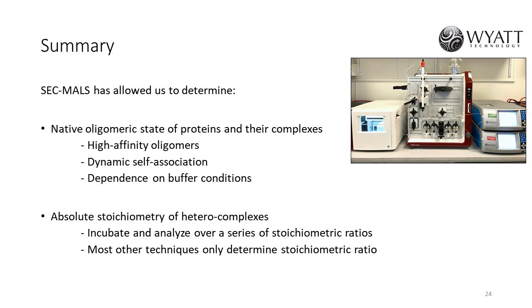Okay, thank you. What is the molecular weight of the largest complexes? Are you approaching the void volume of the Superdex column? Yeah, the molecular weight of the largest complex was about 250 kilodaltons, and like the previous question, if it was larger, if it was an aggregate, it would have come out in the void volume of the column. Okay. But it didn't. Yeah.